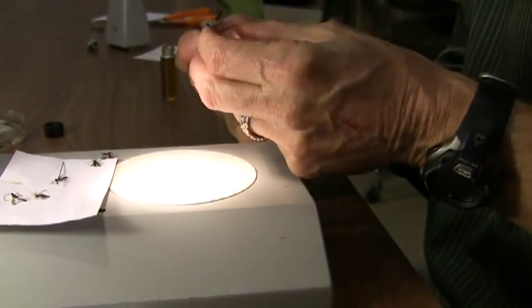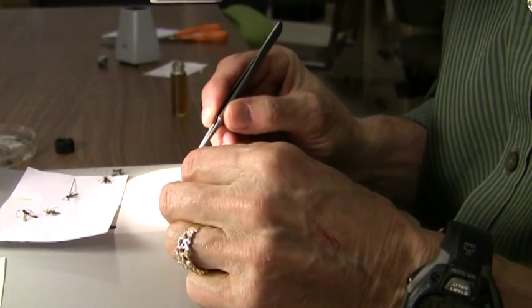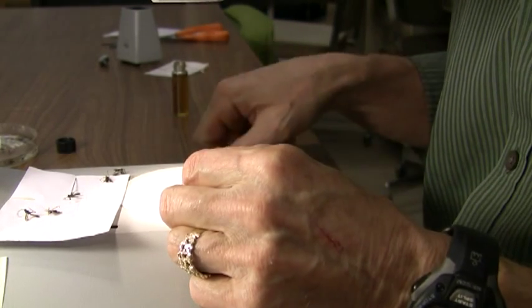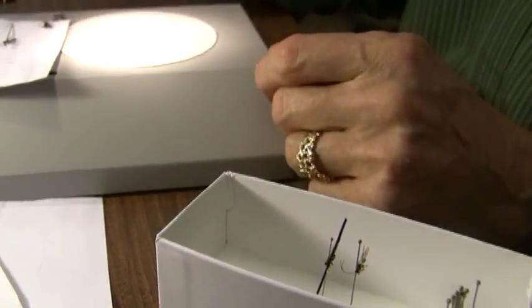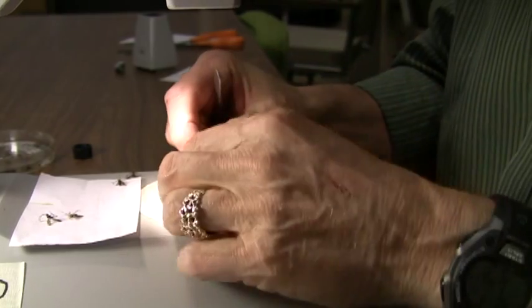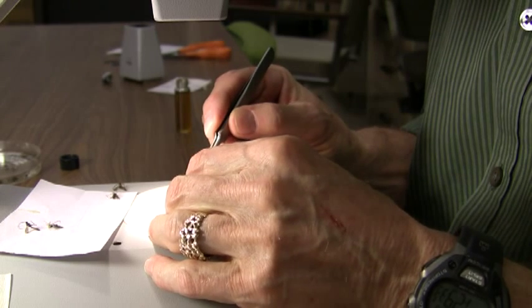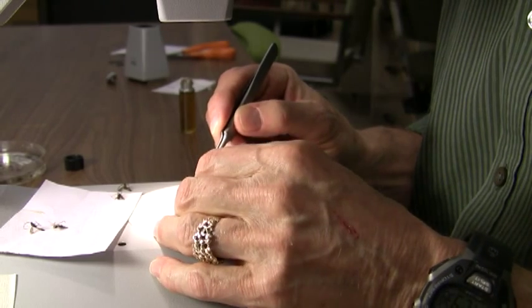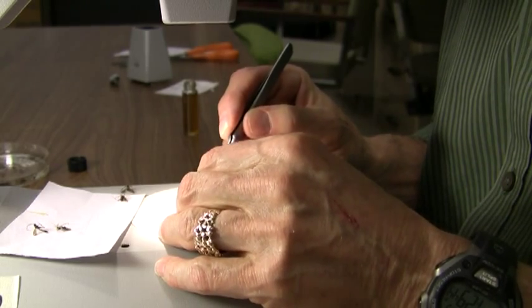Have a look at it. Then that one could have been perhaps a little lower on the pin, just to give us room to handle it. We can then push it down a bit. Okay, looks good. And finally, the third one that we've done here. Okay, well, that's really all there is to it. All three are perfect, or at least close enough for what we're trying to do. Again, since you're just gluing the side of the body, you can actually move the antennae around, move the wings around a little bit when they've been done.